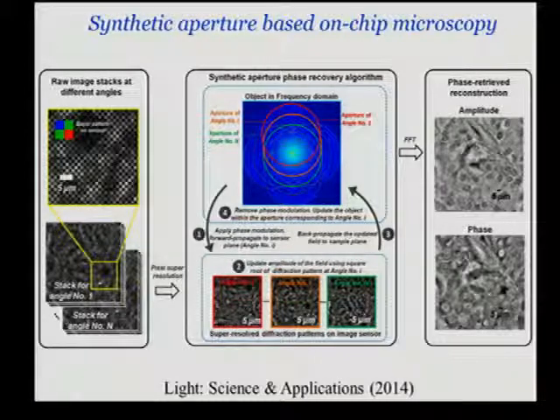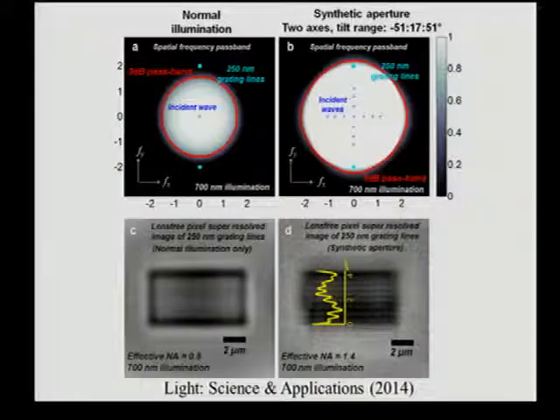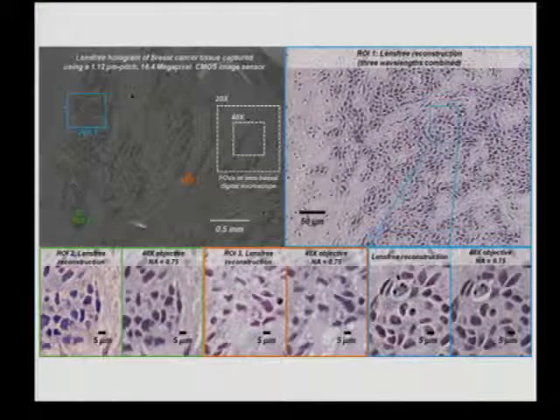But if you synthesize all these different angles, you essentially increase the passband of your spatial frequencies from a circle like this in spatial frequencies to a circle like that due to synthetic aperture. And this gives us a numerical aperture that is larger than, in this case, the refractive index of air, which is essentially still limited to less than 2 times the refractive index of air in this case, mostly because of signal-to-noise ratio. And this also helps us with phase reconstruction stability for complicated objects like tissue samples.